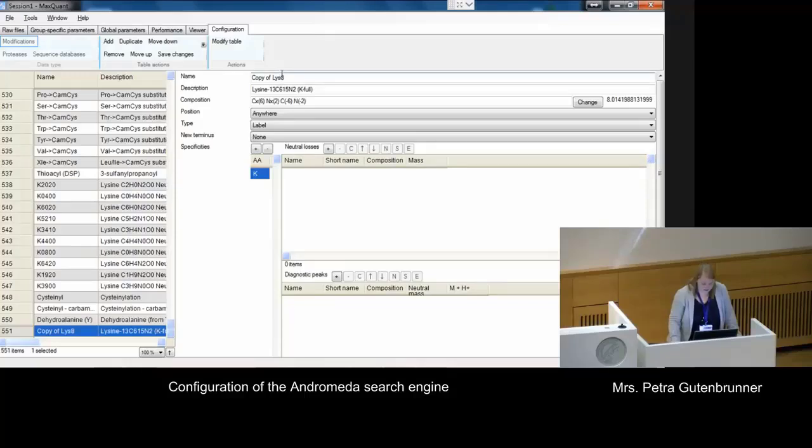In our case, we can change these values to histidine 8. And this is also a nice way if you keep adding similar modifications, because then they all have the same structure. So here we modify this. We said these are 5 heavy carbons and 3 heavy nitrogens. This information is arbitrary, it's just good to know for you. And it's on the histidine.